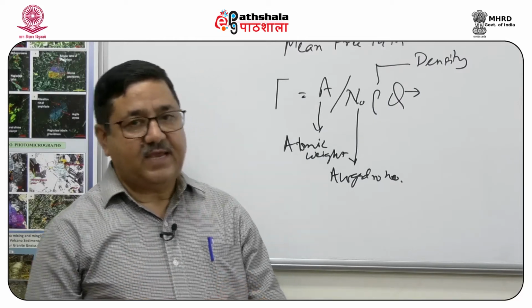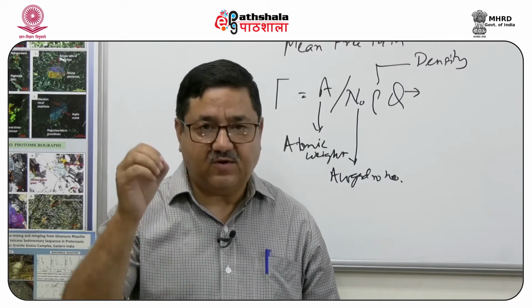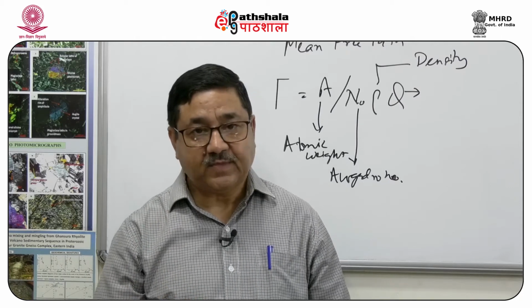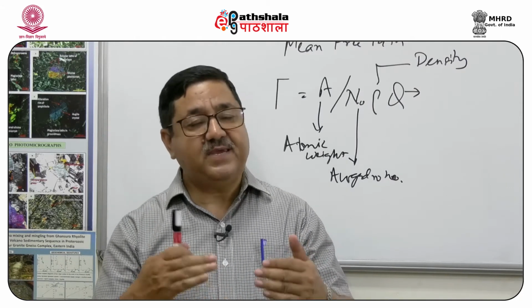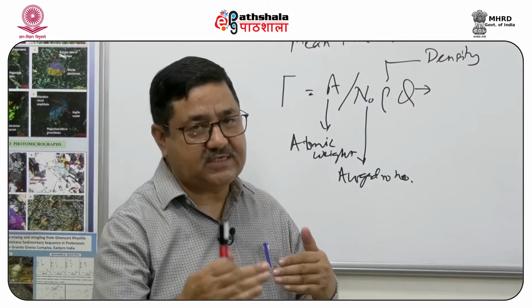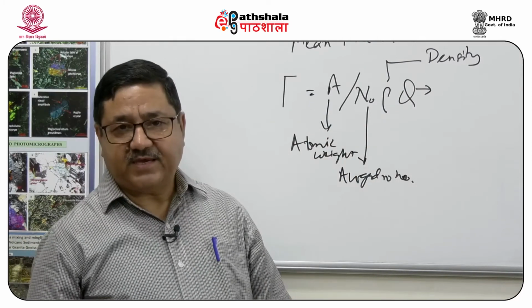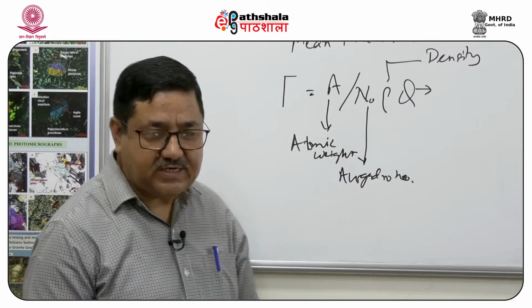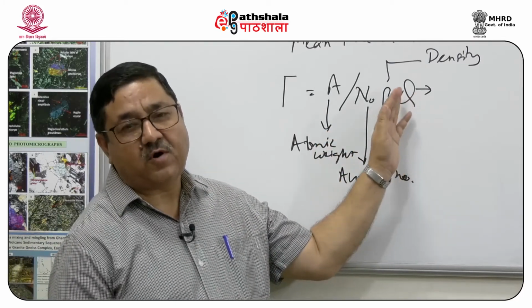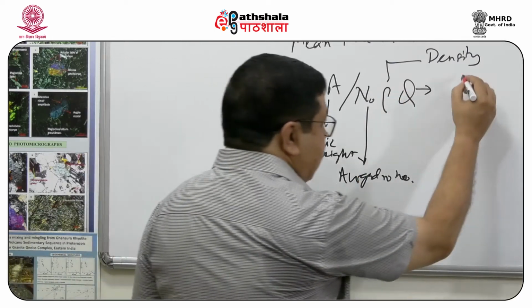Till such time an electron loses all its energy, that is, let us say from 10 kilo electron volts to when it comes to rest or 0, it will pass through several mean free paths, and the average path will be a sum of all these mean free paths. Once we look at this equation, the electron will lose its energy differently in materials of different rho or different density, which can be modeled.